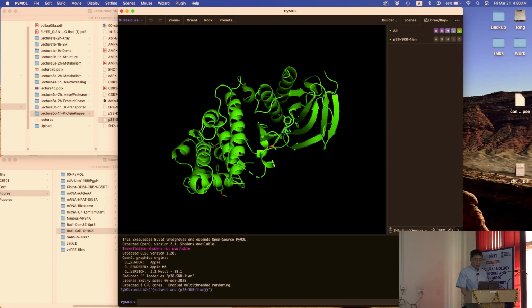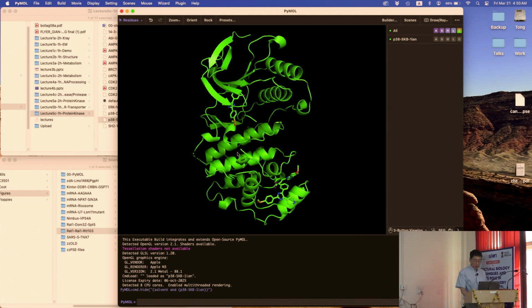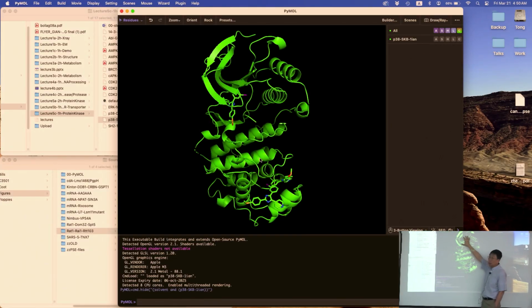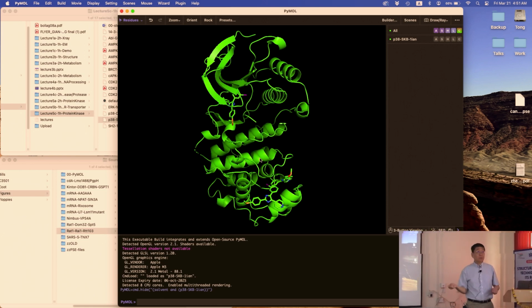So we open it, high waters. And you can see this is the canonical view for a protein kinase. Large lobe at the bottom, small lobe at the top. Okay, the compound's right here. The one right there. Actually, another one on the surface, which is the crystal packing. So that's why I didn't show that. You see something similar?